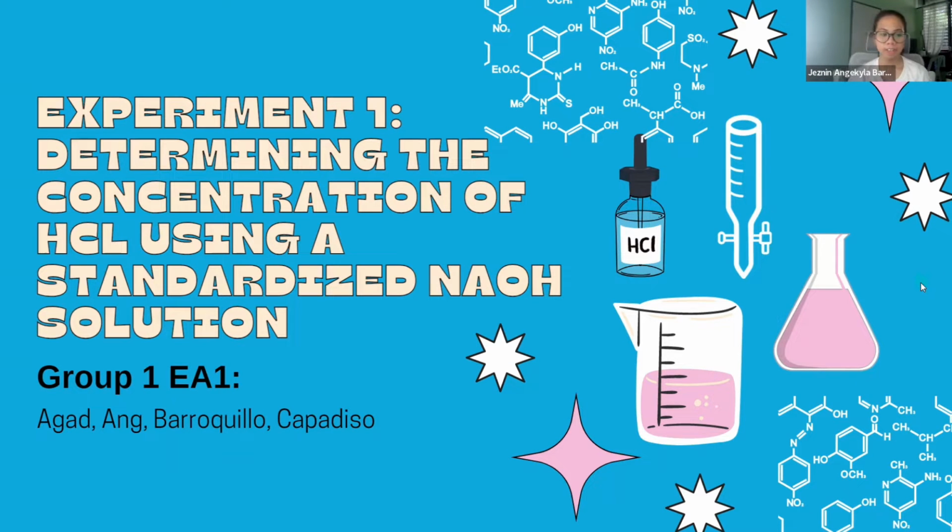Today, we'll be reporting the first experiment entitled Determining the Concentration of Hydrochloric Acid, or HCl, using a standardized sodium hydroxide, or NaOH solution.